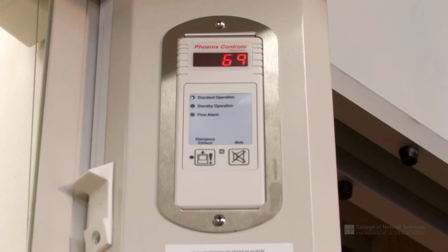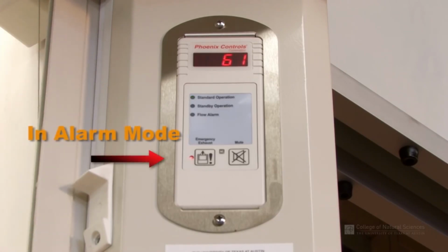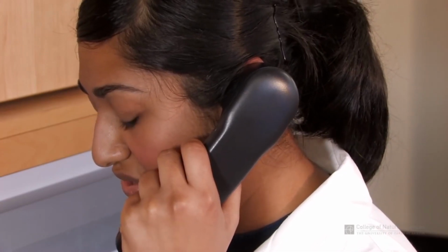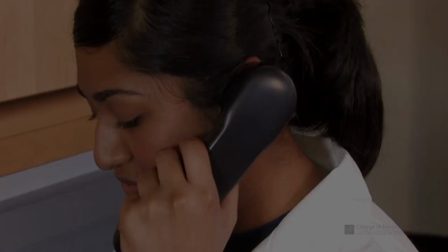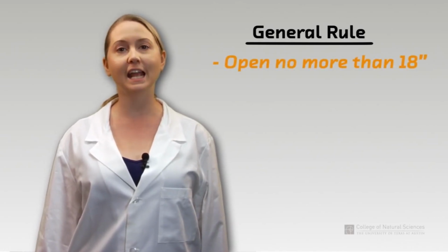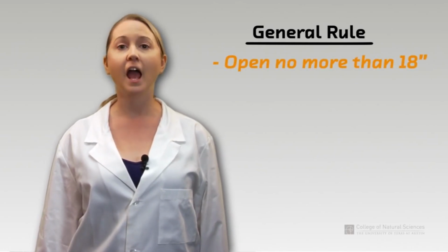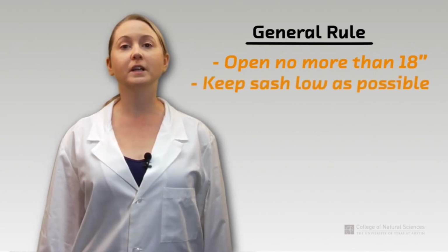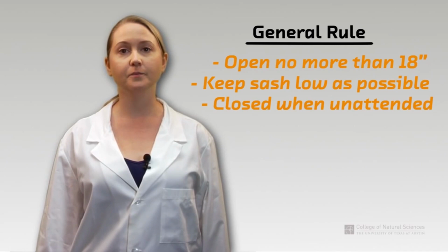Before starting work, you should check the fume hood monitor to ensure that the hood is functioning properly. You should never use a fume hood when it is in alarm mode, and you should never mute or disable the alarm. Instead, call EHS if the alarm is activated. As a general rule, the fume hood should not be open more than 18 inches when you are working and should be kept as low as possible. The fume hood should be closed when unattended.